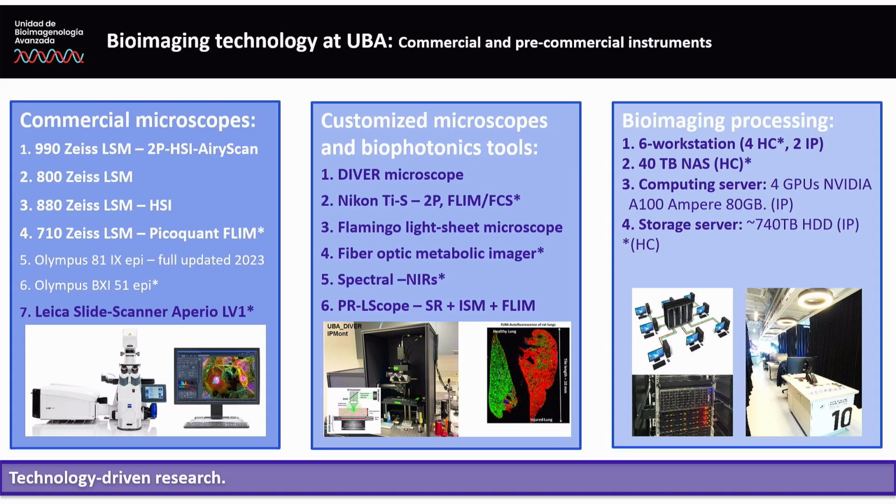So speaking about technology, we have several commercial microscopes, with the new 990 that we just received, but we also develop other technologies that we either adopt or basically develop in our place. We also have capabilities for bioimaging processing with several high performance workstations and also computing and storage servers for the technologies that produce a massive amount of data.